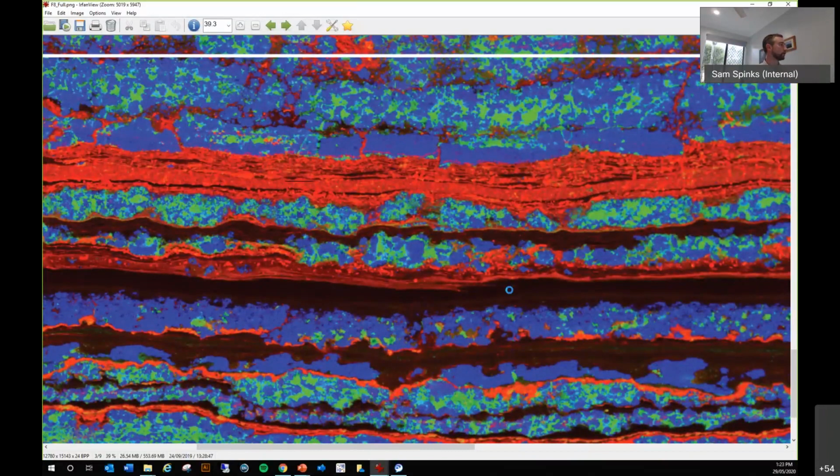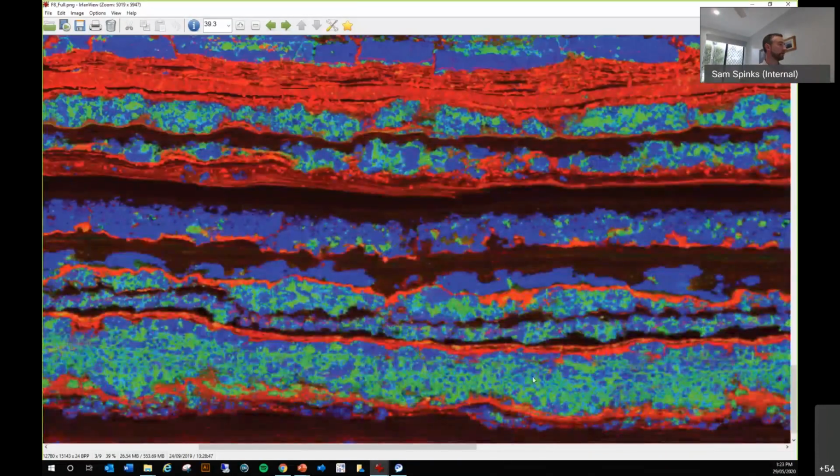So this is good evidence for a carbonate replacement model in this facies, whereby the fluids have come in, they've dissolved the carbonate, and sphalerite has precipitated at the site of that dissolution. Go back into PowerPoint now.